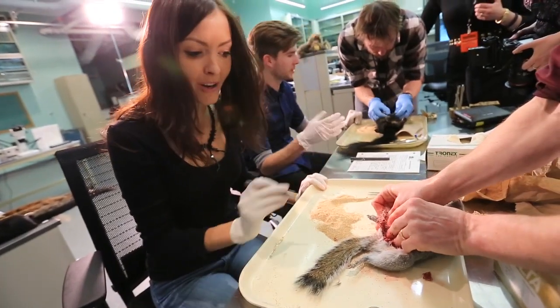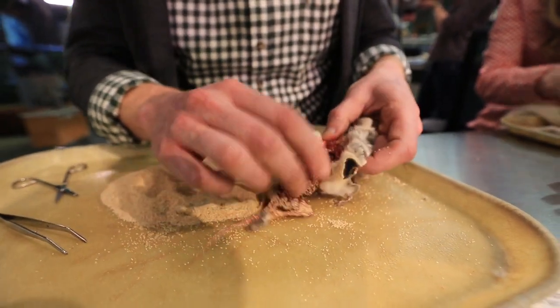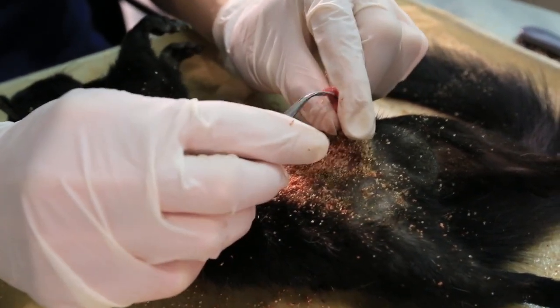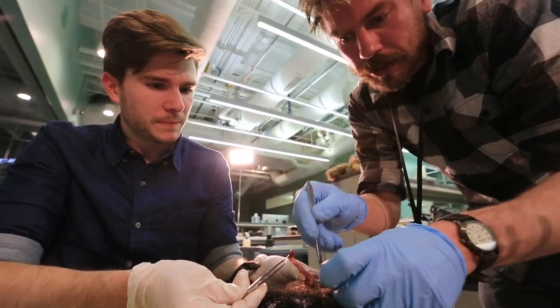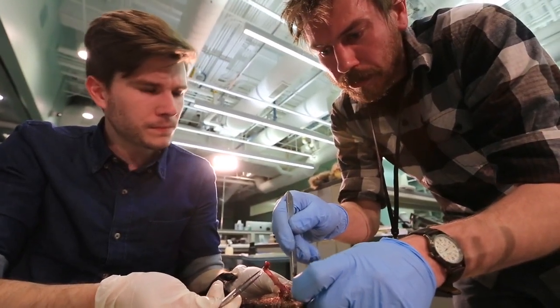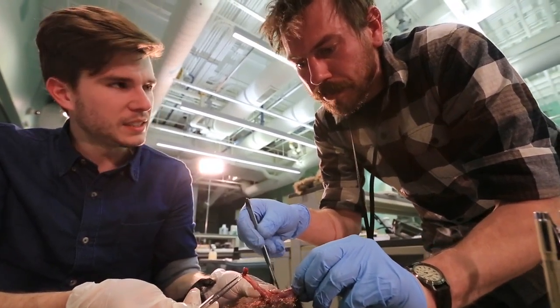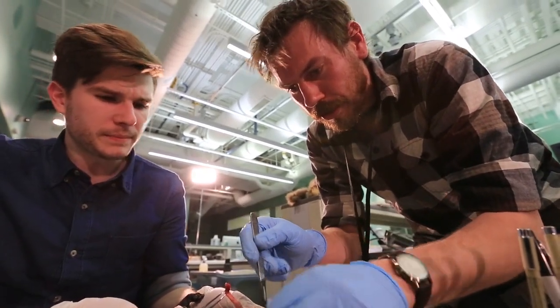It's a delicate process where I have to cut occasionally just to break the muscle from the skin. Most mammals actually have a baculum, or penis bone, and that's what we're trying to get out to have it go along with its skeleton. You want to preserve the skin, so you have to deal with the genitalia. All around, you go through the leg, get the other leg out. Pull the tail out, so the tailbone, all the vertebrae there are out.